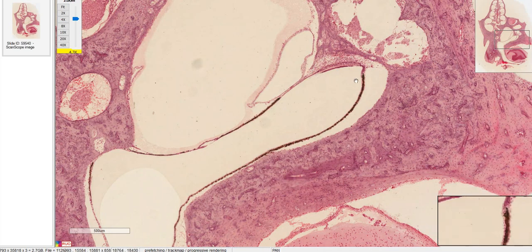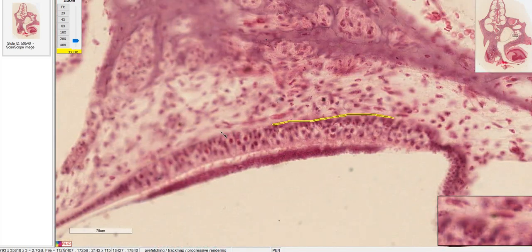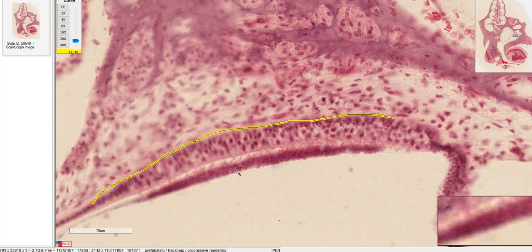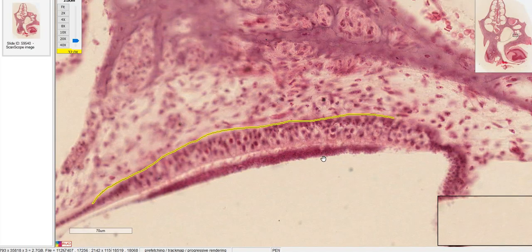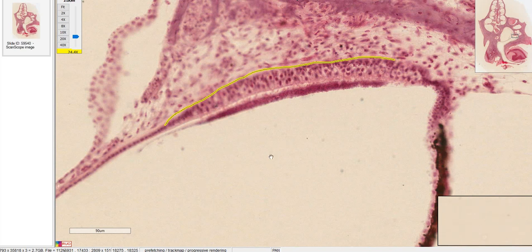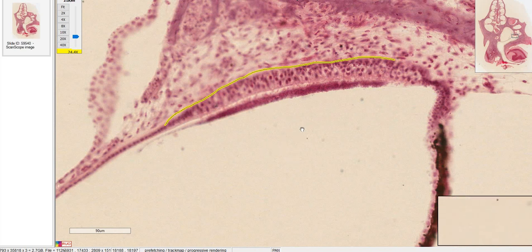We're going to zoom in on the particular part of the utricle or saccule — it's called the macula. These are also hair cells with stereocilia, and the stereocilia are connected to the otolithic membrane, which is a membrane of little rocks basically. The otoliths are the little stones that get displaced when you have benign positional vertigo, and you can attempt the Epley maneuver to try to bring them back. The fluid here is also endolymph — hair cells, whether in the vestibular system or the cochlea, are bathed in endolymph.